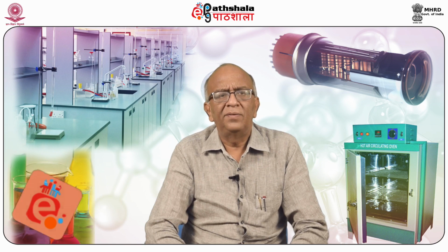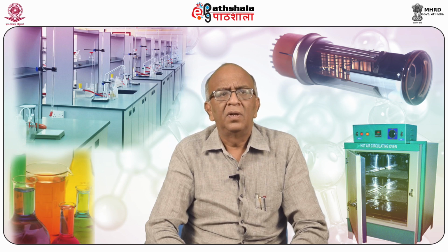Today, I shall take up cleanliness and neatness in the laboratory under the paper Fundamentals of Analytical Chemistry.